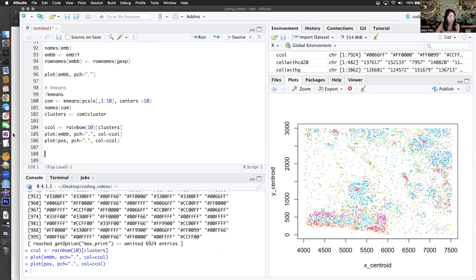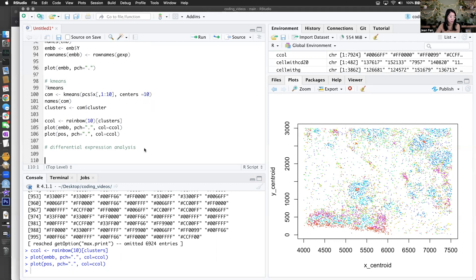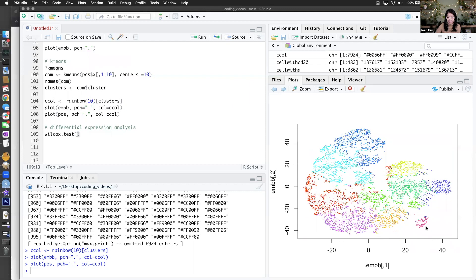Part of that will mean identifying genes that are upregulated in each of these clusters. In the context of the class, we'll learn about t-tests and Wilcoxon rank sum tests. So we will just want to make sure that students will be able to run a Wilcoxon rank sum test to identify genes that are upregulated. Let's pick this cluster here — cells of interest.